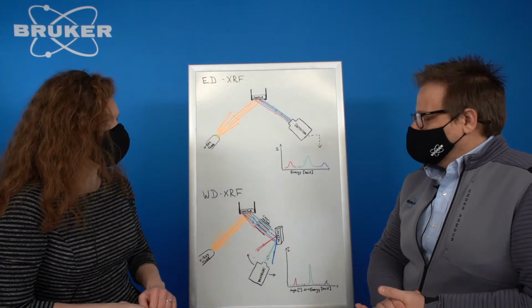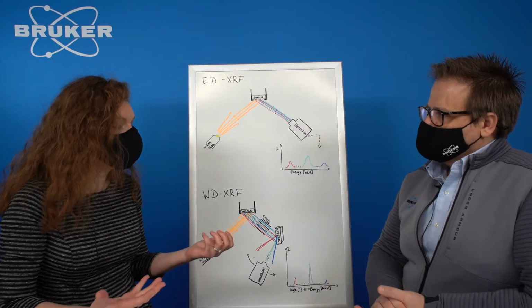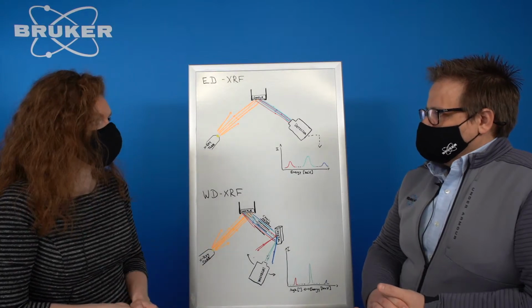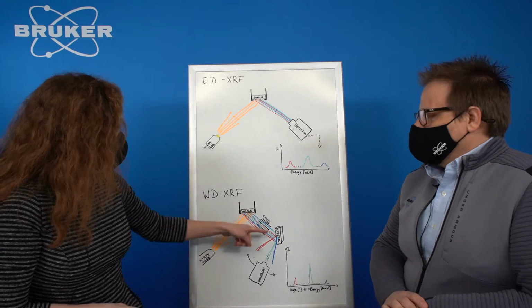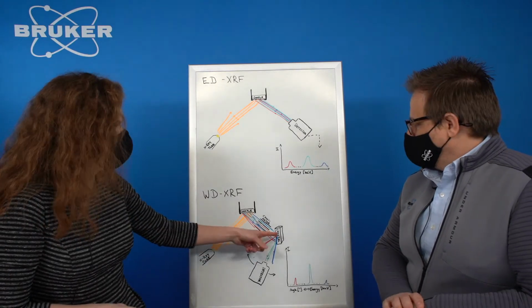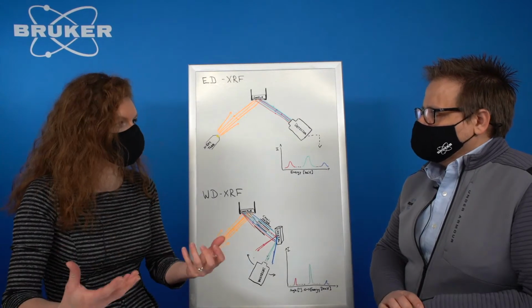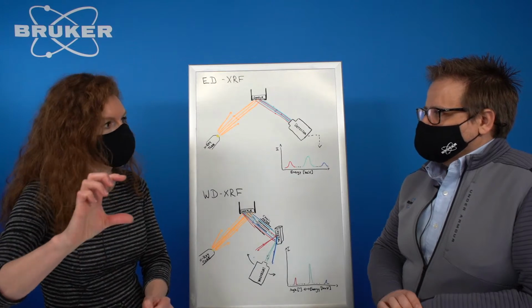The nice thing is, if you're just interested in a certain range of elements, you can just buy one crystal if that's what you want, and you get, as I said, the nice resolution. Then at a later time you can add more and more crystals. Yes, because this is actually a magnetic mount. So once you get your crystal, either somebody from us will install it, or you can be talked through installing it yourself.